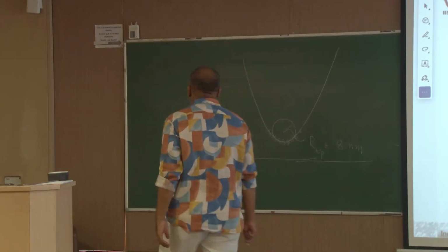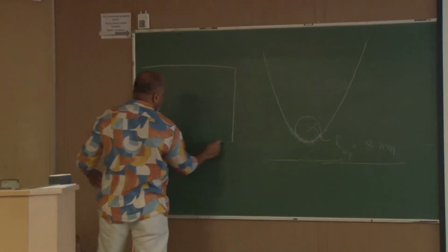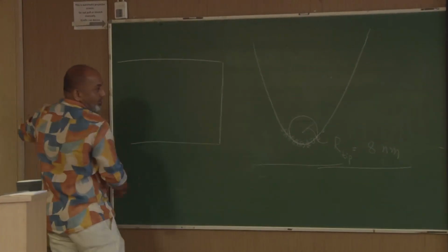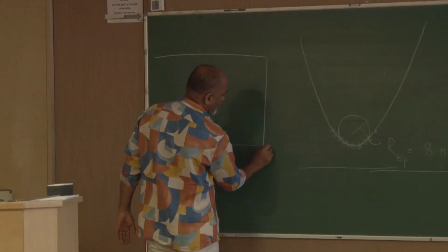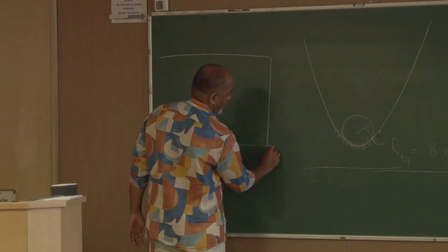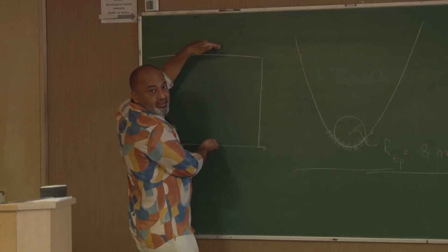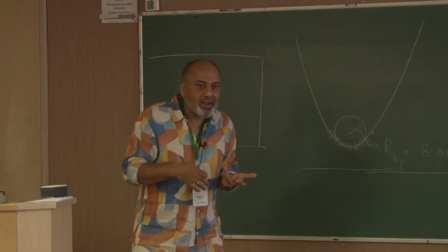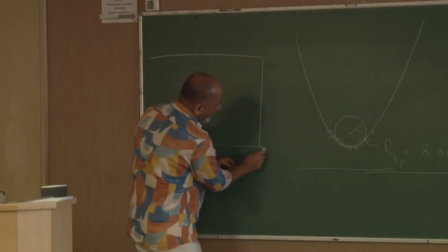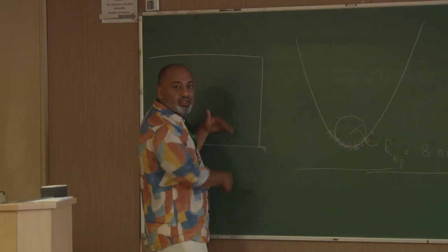So imagine something like this, and this is extending 3.5 millimeters, right? It is quite big, and the cantilever is there, which is micron thick. This is millimeter in thickness. This guy is like a rigid thing, it does not bend. What bends is this thing only, down. So it is something which is attached to a rigid thing.